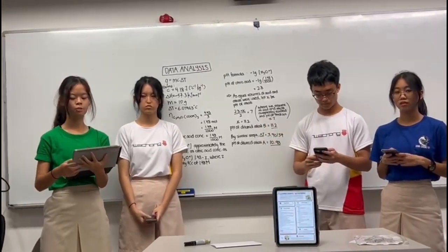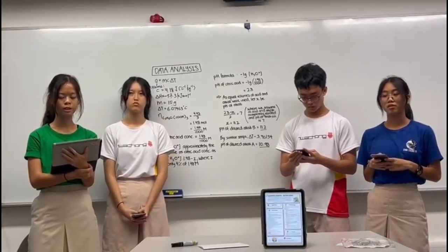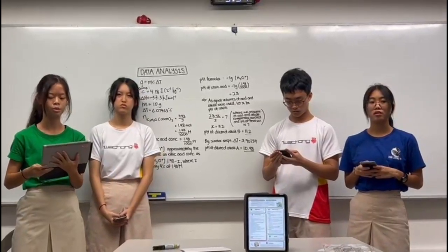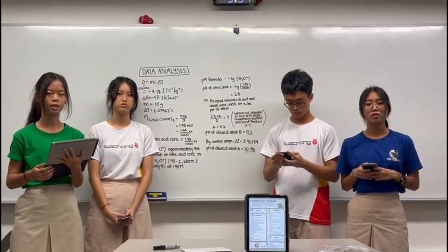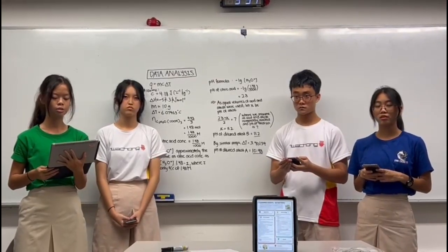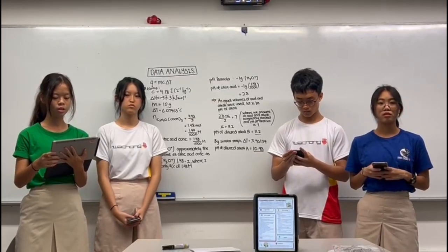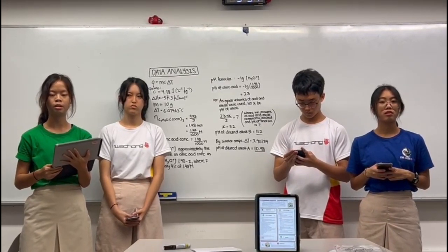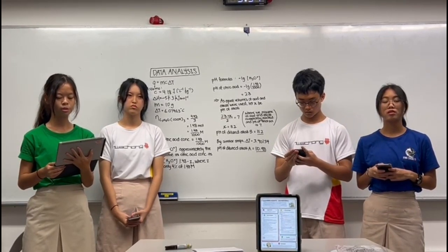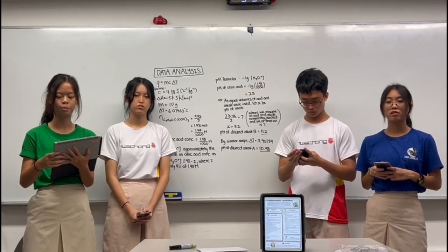In terms of limitations for our experiment, there was heat loss that we couldn't entirely prevent. Also, there were some other components in all of our reactants that may have affected the main reaction between citric acid and sodium hydroxide. However, we took this into consideration when choosing our reactants, and the 3 reactants we used in the end are those that contain the least secondary components. To ensure our safety, we also made sure to wear gloves and goggles throughout the experiment, as our reactants were corrosive. We also ensured that there were no exposed wires from the microbit before starting so as to prevent electrical injury.